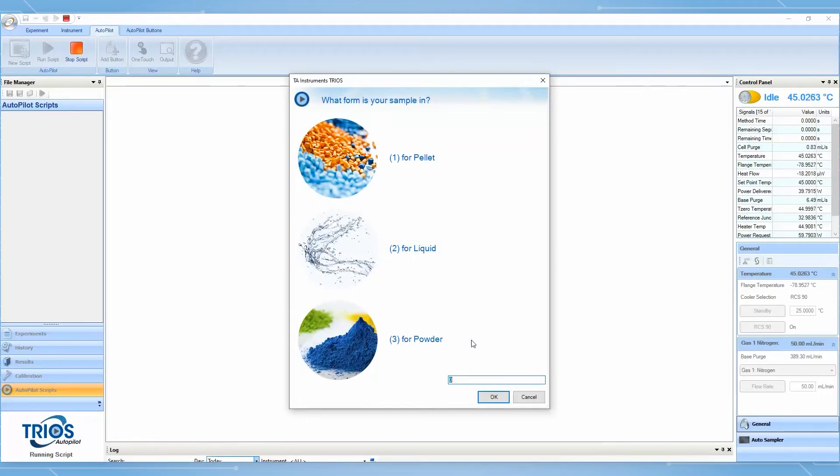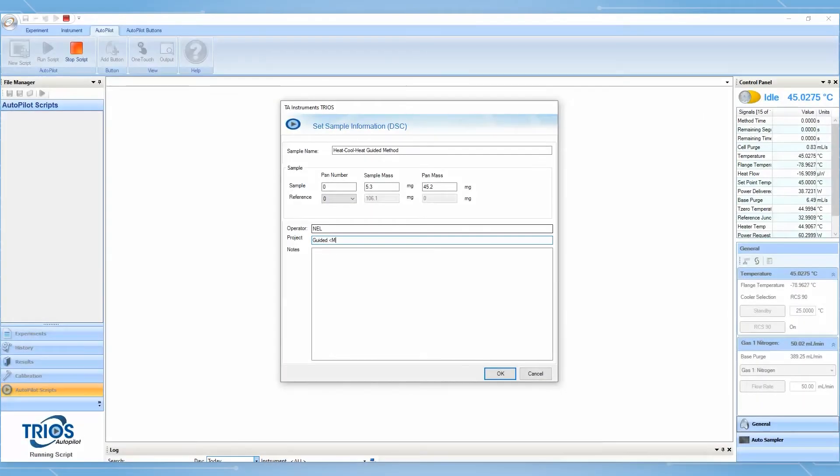Guided Methods also provide an experiment template with reasonable defaults, but still allow you to customize parameters to your testing needs.